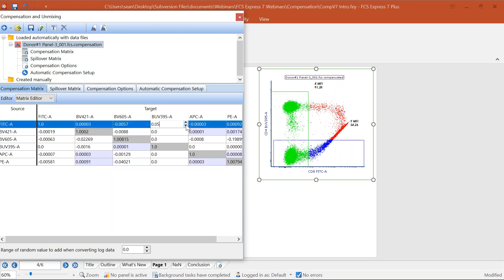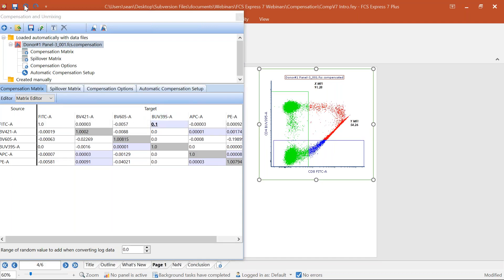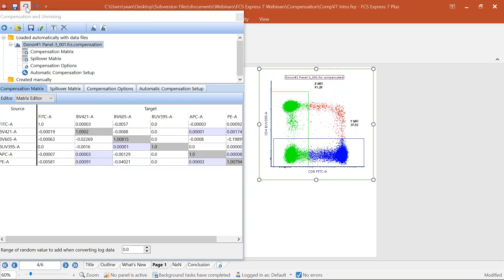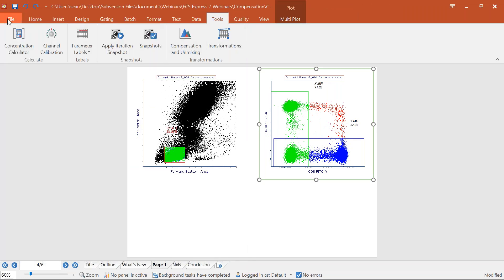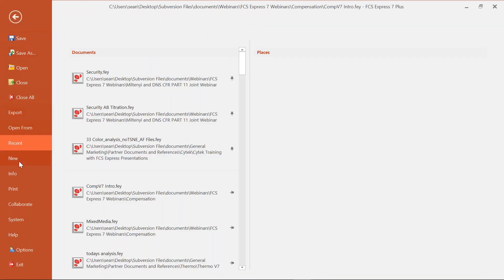Undo and redo works for all compensation changes as well, so if you want to get your compensation back from the time of acquisition it's very simple. Again, there aren't many reasons to be using manual compensation — if you find yourself doing it often, it's a good idea to speak to experts at your core facility or reach out to the team at support@denovosoftware.com to get better single stain controls.